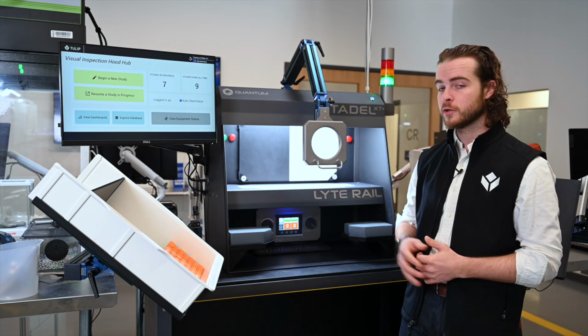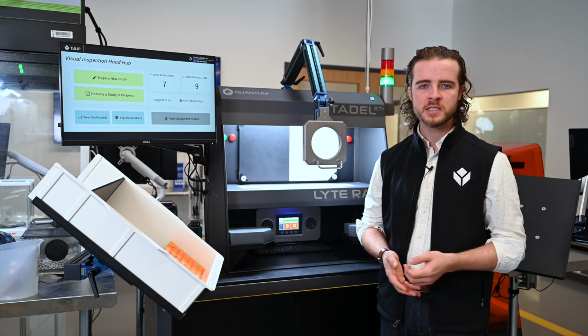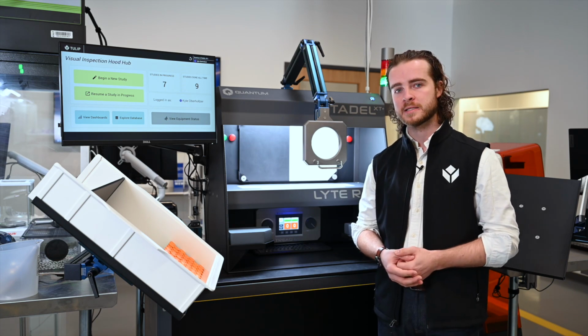Now, these kinds of hoods are normally used to inspect things such as IV vials and syringes for defects such as scratched glass or floating particulates. Normally, this inspection is done by hand. The user has to inspect a specimen, either write down a defect or place it in a defect bin, and then later go on for categorization at the end of the day.